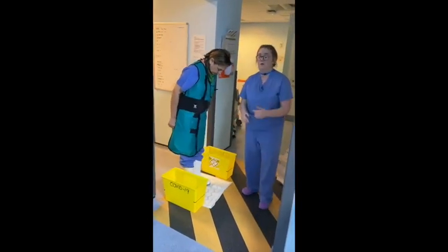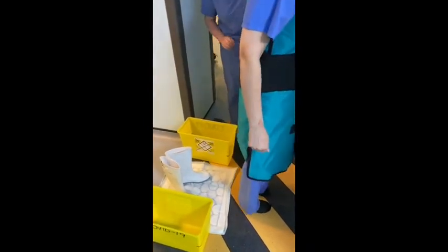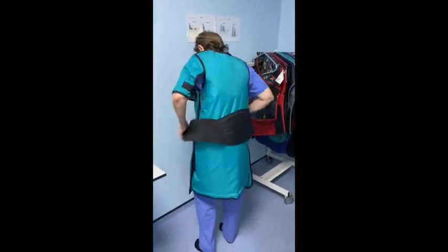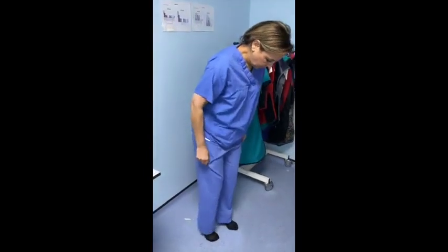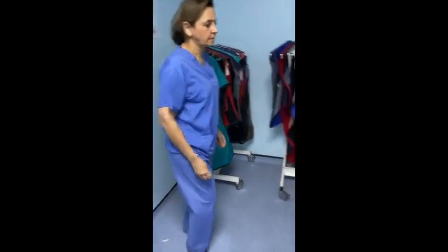Now from here, if you come forward a bit, you hold on to the side, heel to heel, pulling up, and then once you feel like the wellies are loose, you gradually bring your leg out. And the same on the other side. You might have to do a little bit of a wiggle to get the second one off, but you are free from your Wellingtons. This is where you can remove your lead. If your trousers are still tucked into your socks, you can remove them from your socks. You will wash your hands.